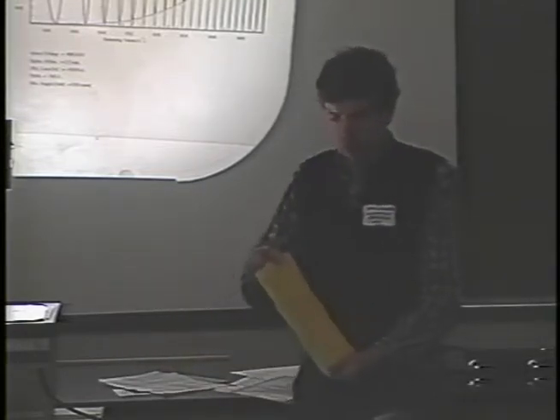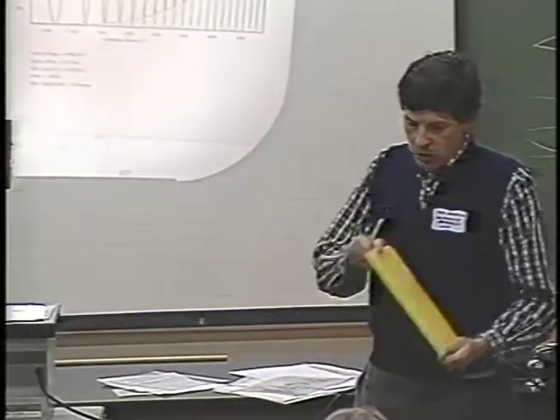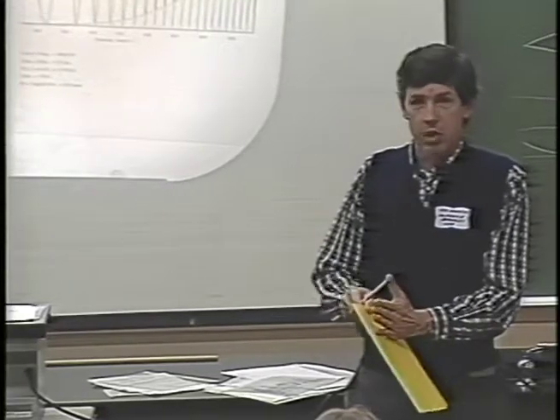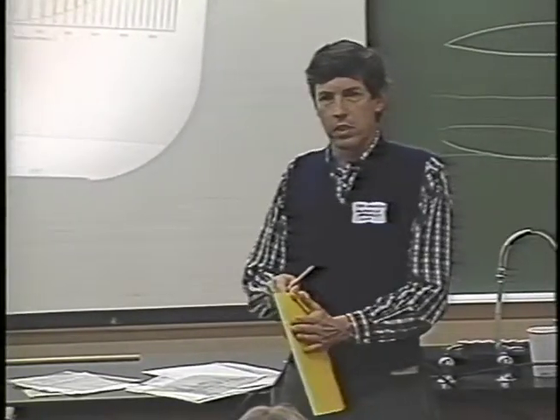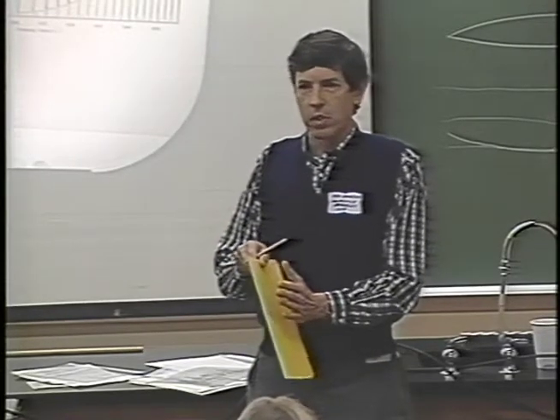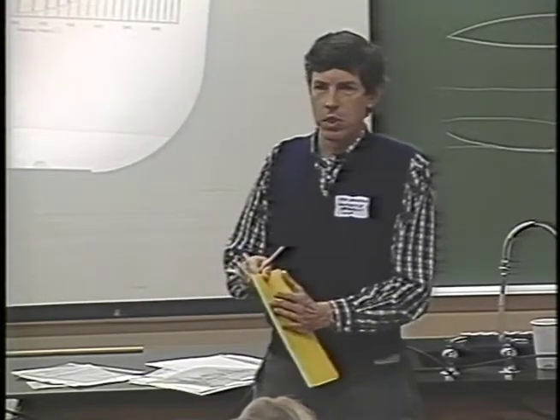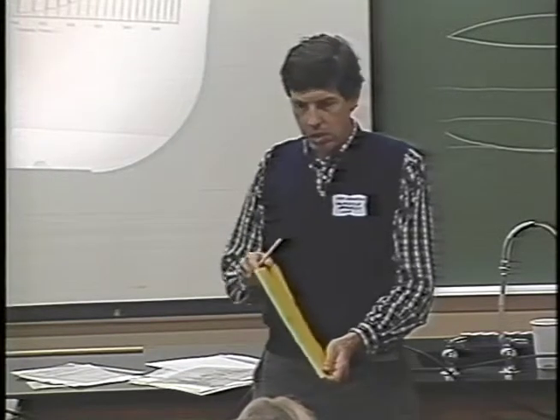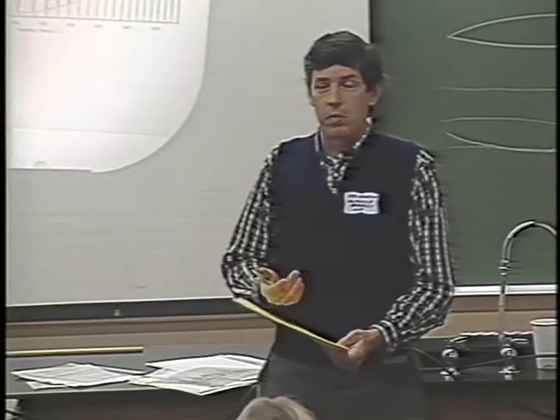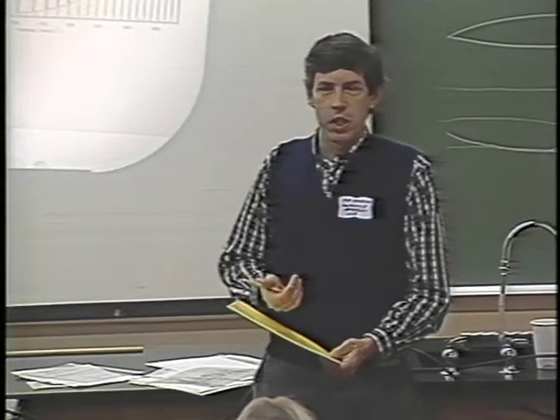But if you have an object tilted like this that's moving in this direction here, that's really going to smear out the resolution in the direction perpendicular to the tilt axis. And that's precisely what we see with tilted specimens, that we have quite a difficult time getting good resolution in the direction perpendicular to the tilt axis. Now, that's not, unfortunately, a problem that's better with the high voltage microscope.